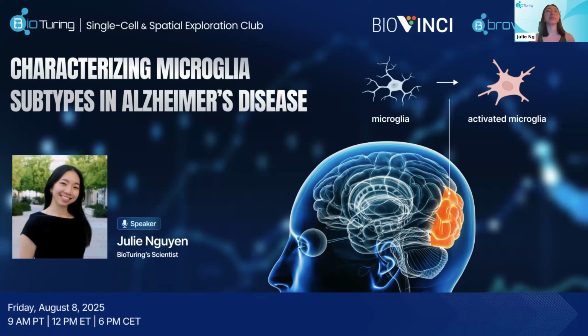So for today's club, we will be characterizing microglia subtypes in Alzheimer's disease. In this data set, I was able to identify some activated microglia subtypes. And for this week's session, I will be giving a demo on both BBrowserX Pro and BioVinci.